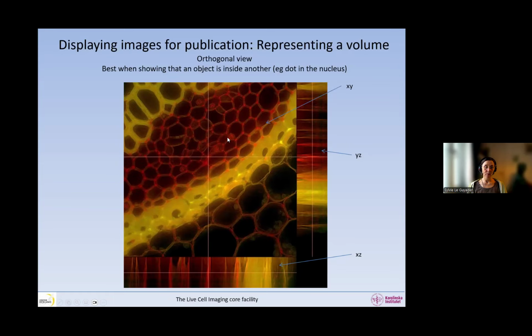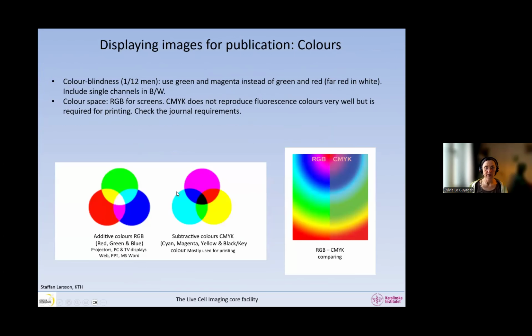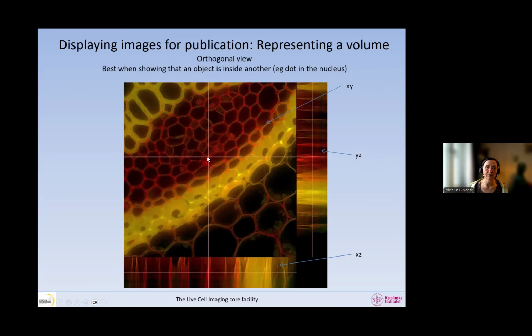because this is a point confocal image. And you can also change which image is displayed in here by moving this cross. Here. So if you move the cross, you can bring this point anywhere and these images will change. Okay, so you can change this image by moving this bar or this one, and you can change these images on the side by moving this.